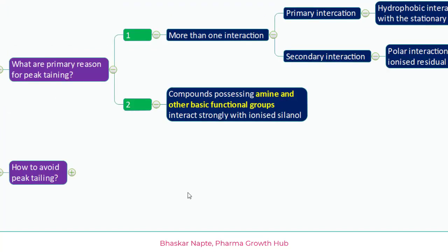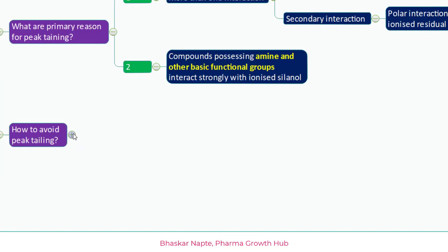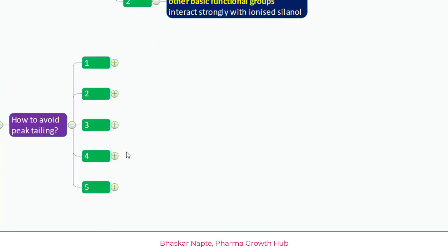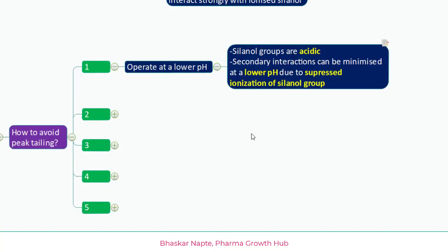Now we understand the two important reasons for peak tailing. In the next section we will talk about five important points to avoid peak tailing. The first one is to operate at a lower pH — make your mobile phase with a lower, acidic pH. The reason is that silanol groups are highly acidic in nature. Comparing type A silica and type B silica, type A silica is highly acidic whereas type B silica is weaker in acidity.